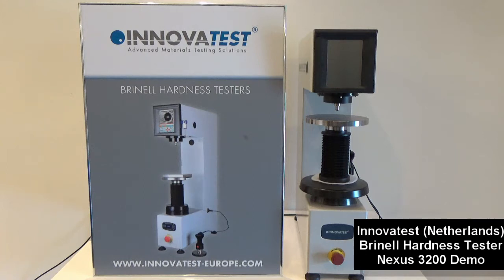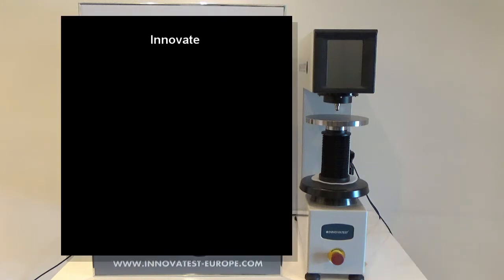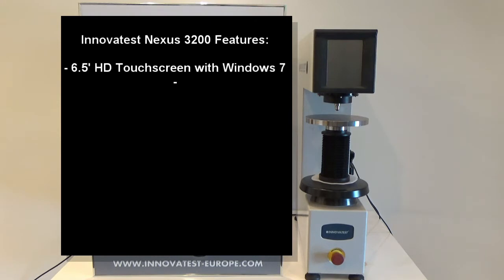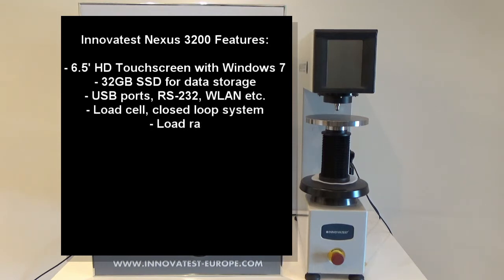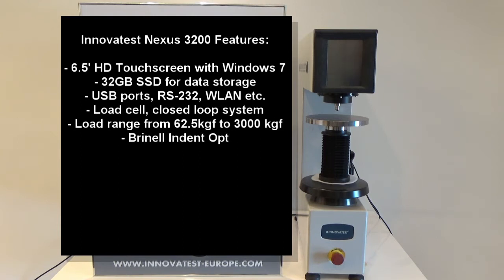This system comes with a 6.5 inch HD touch screen which runs Windows 7 Embedded, as well as 32 GB SSD for data storage and other connectivity such as USB, RS232, and Wi-Fi.